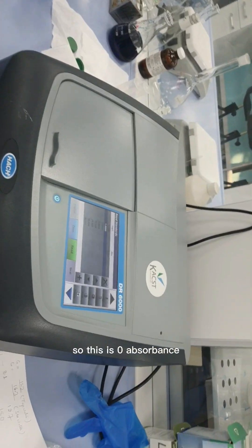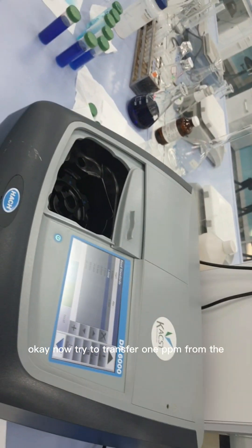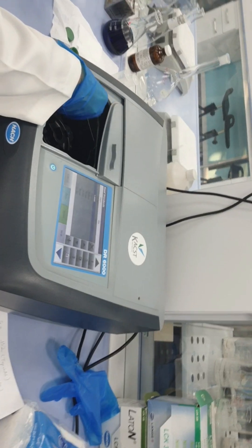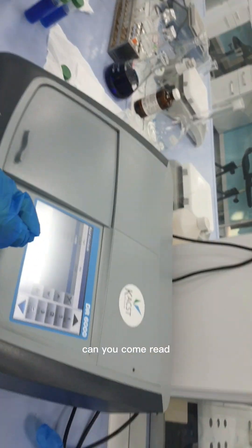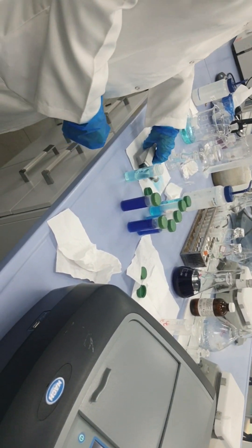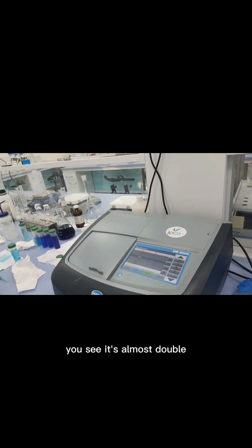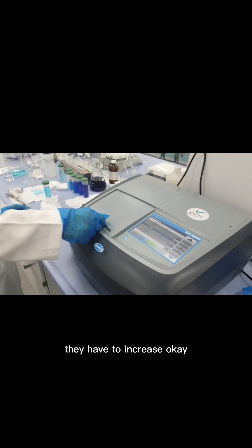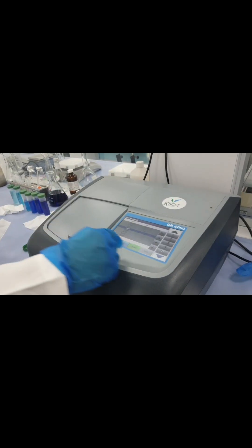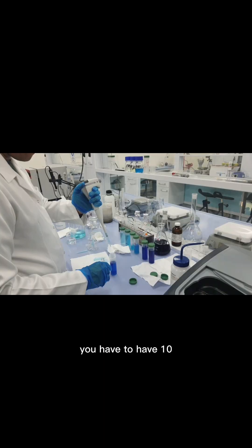The blank reads zero absorbance — this is correct as it is reading the baseline. Now transfer 1 ppm from the vial and press Read. The absorbance is increasing. Now clean the cuvette and add the 2 ppm standard. You can see it is almost double the previous reading — the absorbance values increase proportionally.